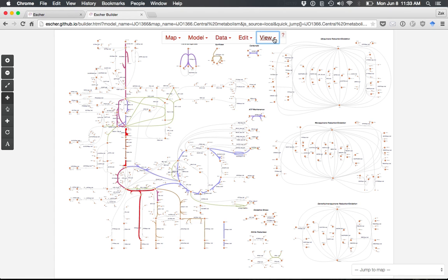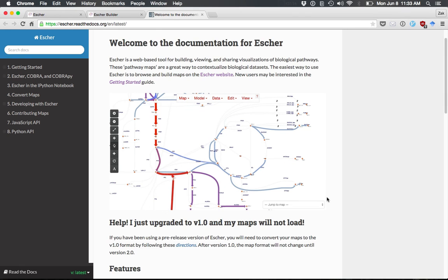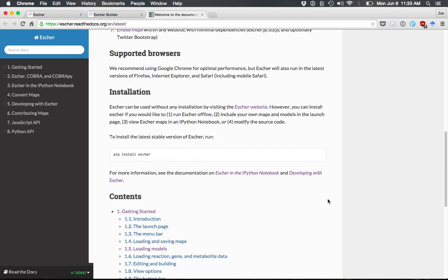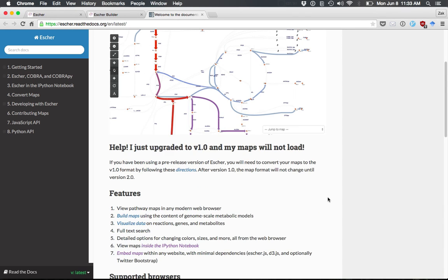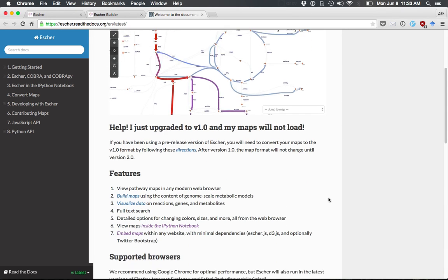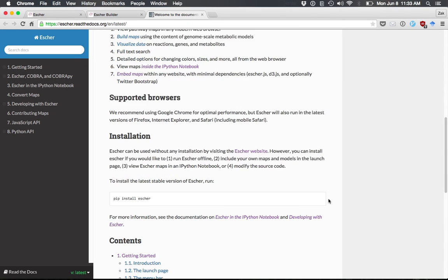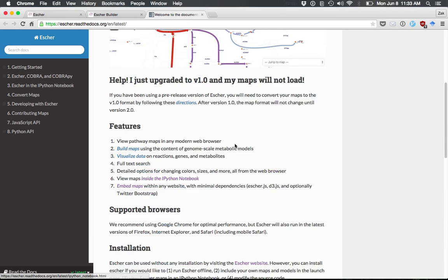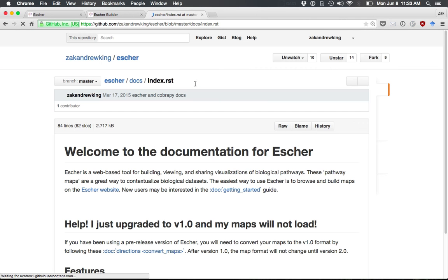You can check out the documentation using the question mark for more details about Escher features. Escher is an open-source project hosted on GitHub, so if you're curious or want to contribute, visit the GitHub site.